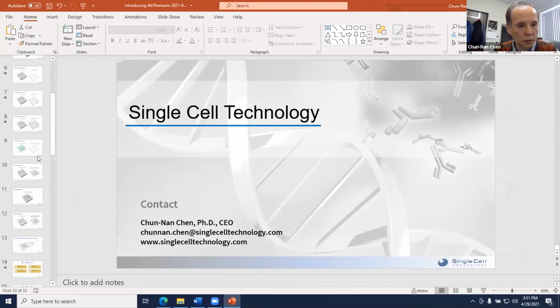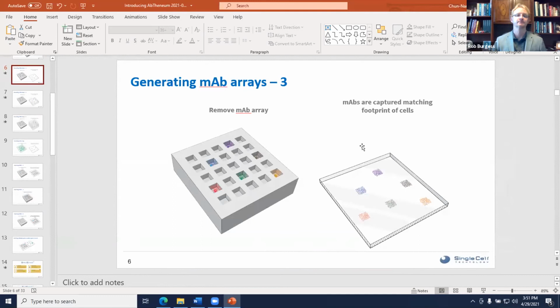That's a good question. Glad she asked. So here, if you capture the antibody on a slide using whatever reagent, that's kind of hard to do. But imagine instead of using a capture agent to capture the antibody here, imagine that this slide is covered with cells, right?